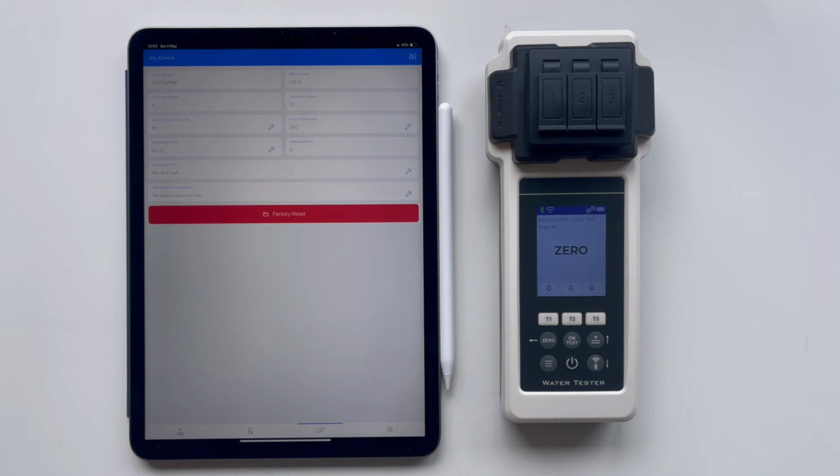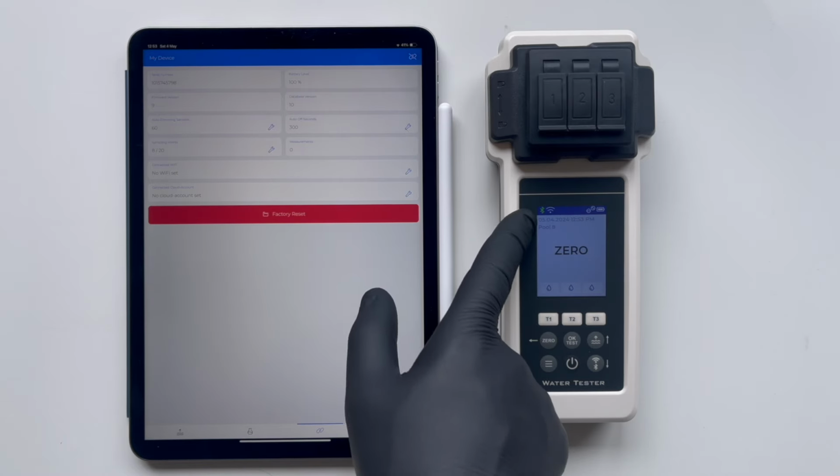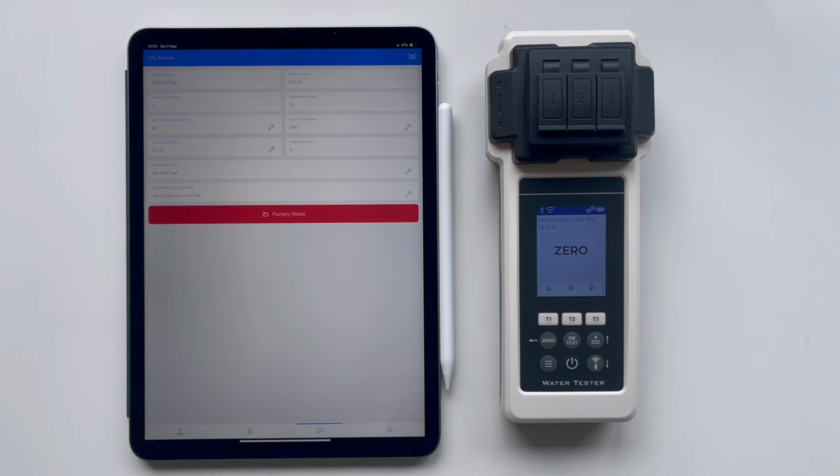However, we won't demonstrate how to perform the tests in this video. In our case, we will save all the results of the tests for sampling point Pool 8, but we encourage you to refer to other videos that provide detailed, step-by-step instructions on how to conduct water tests for each parameter. These instructional videos are designed to guide you through the proper techniques and procedures for testing water quality.